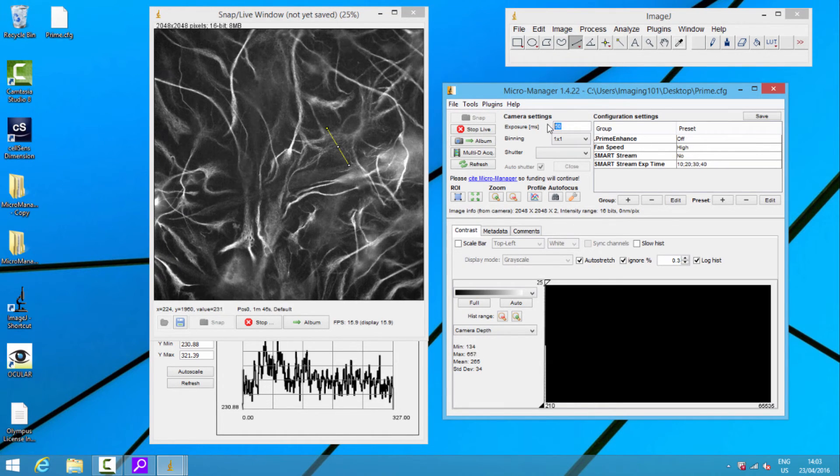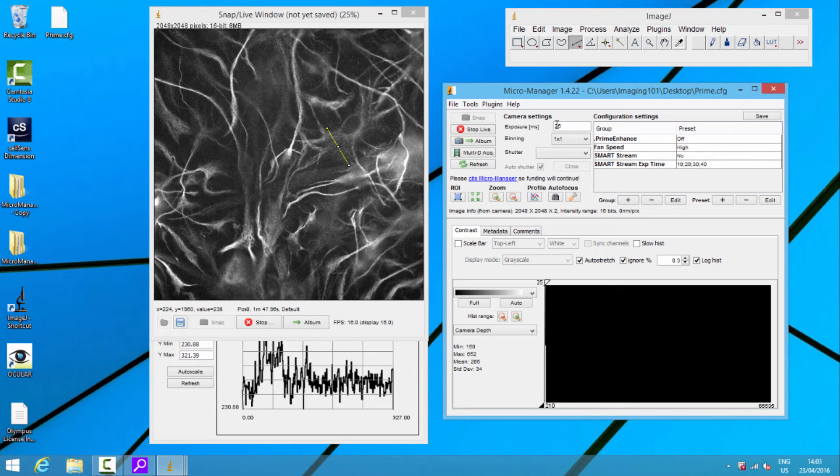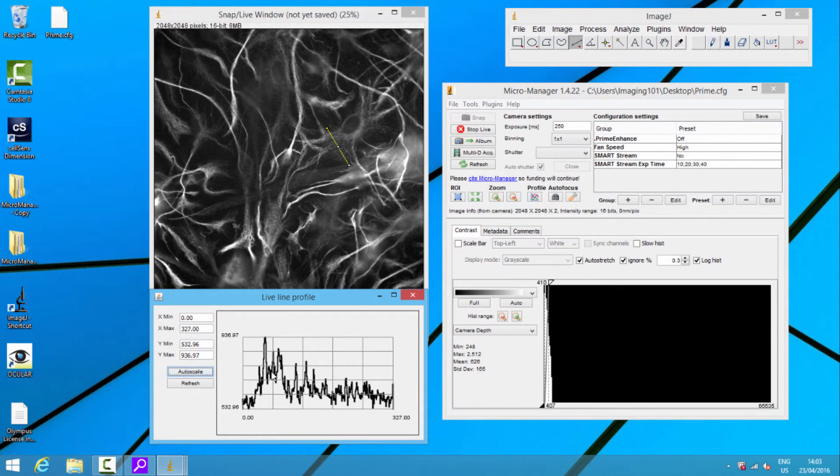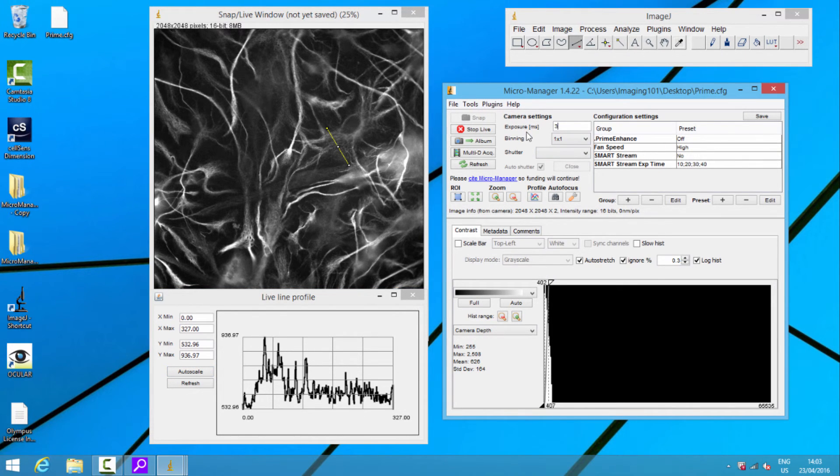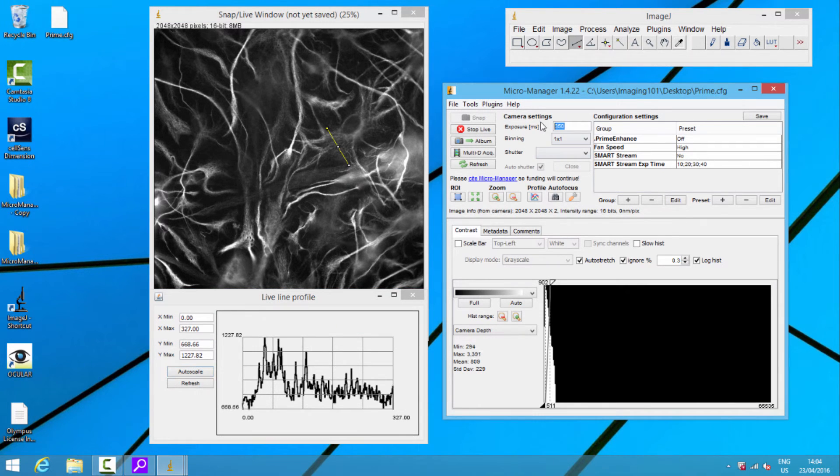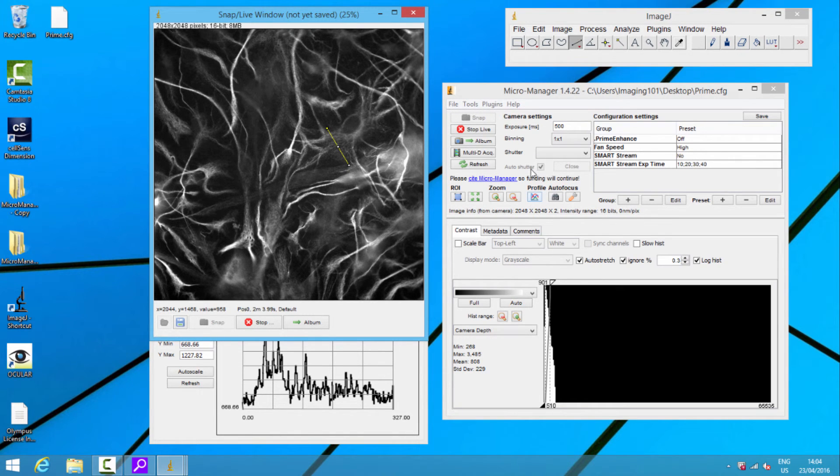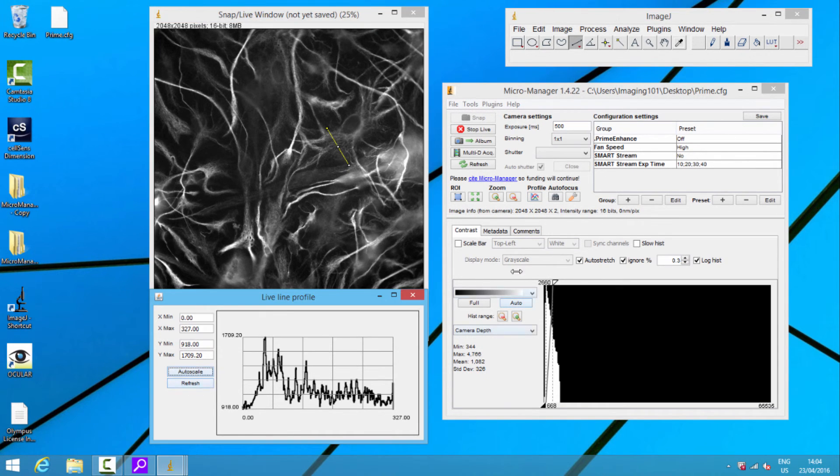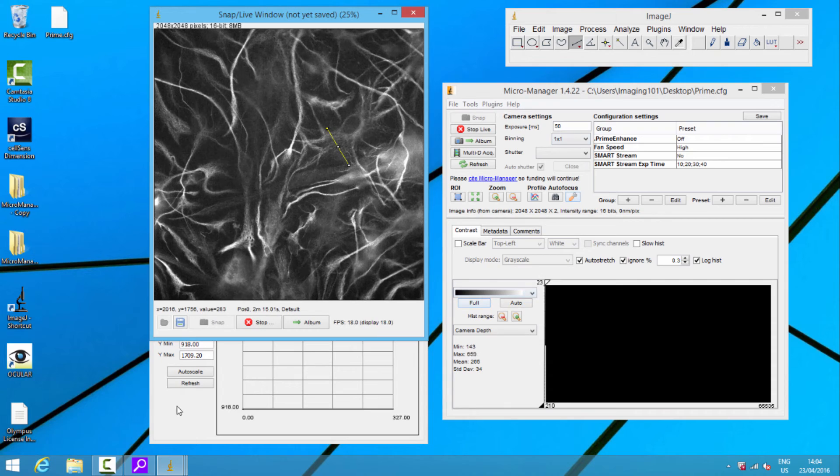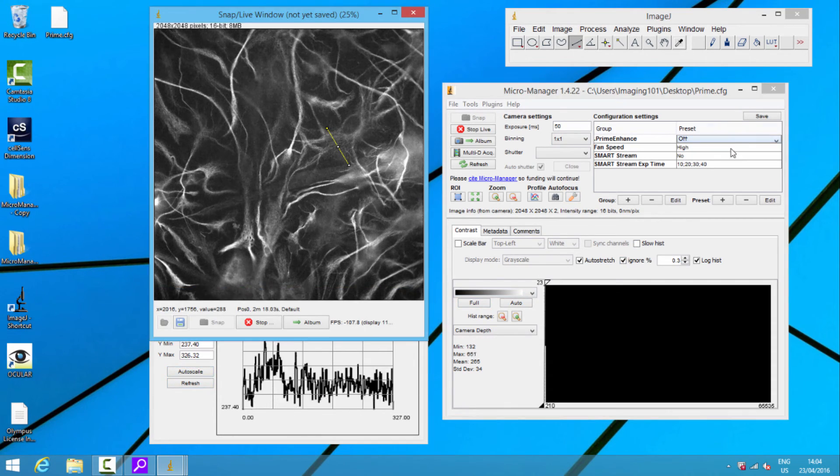This is what everyone else is going to give you with the sensor. We can do it. Let's put it up to 250 and see. It's not as good as 50 milliseconds with Prime Enhance yet. Let's try 350. The image quality is going up. But is it really getting there? 500 milliseconds. We've got more light, more signal. So we have to turn it down. It's getting there really with that. But for me, I'd like to go back and try 50 milliseconds. This is everyone else.